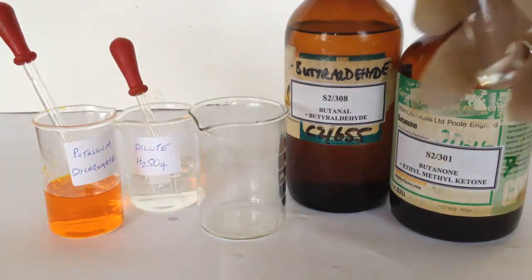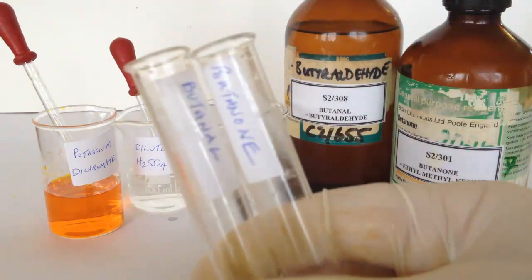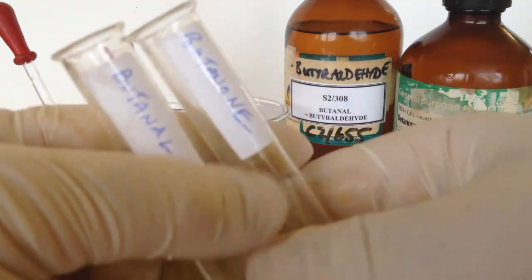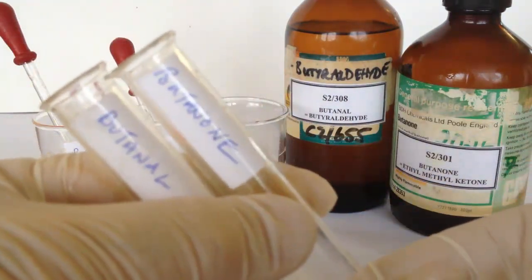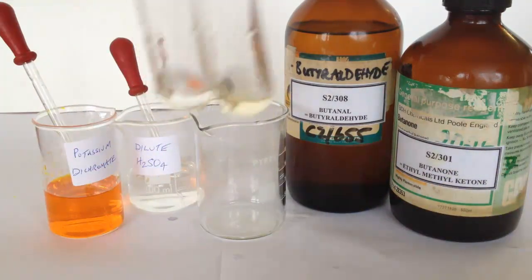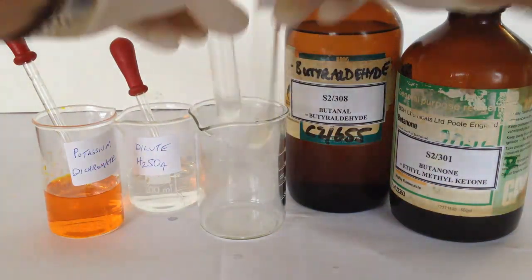You'll see here I have about a cubic centimetre of each of these carbonyls in the test tubes. The lower one is butanal, the upper one butanone.